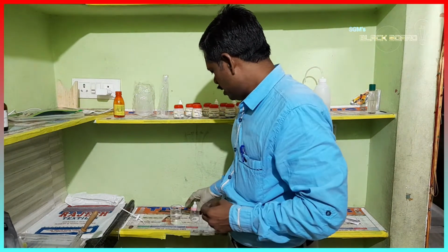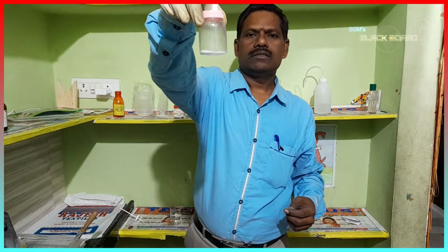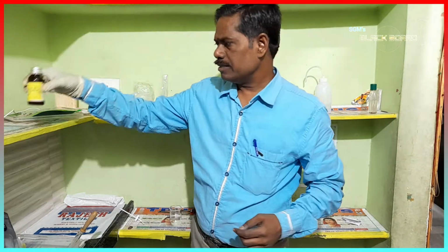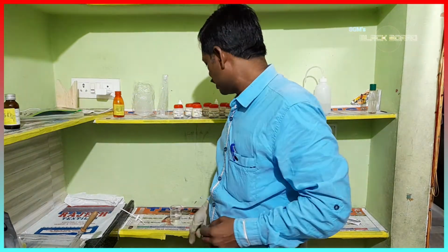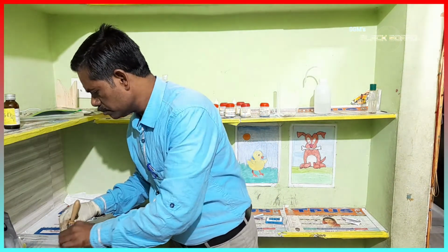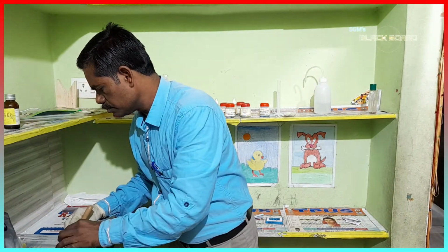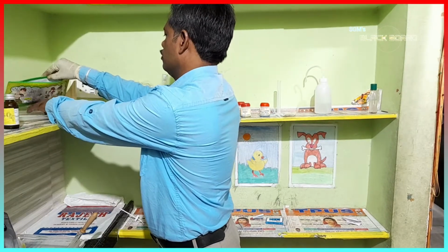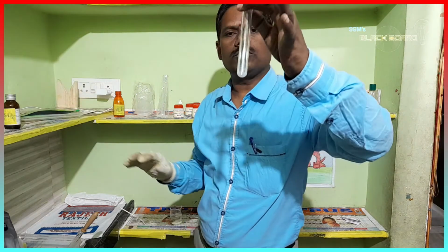For that, I require sodium chloride and sulfuric acid and a test tube.